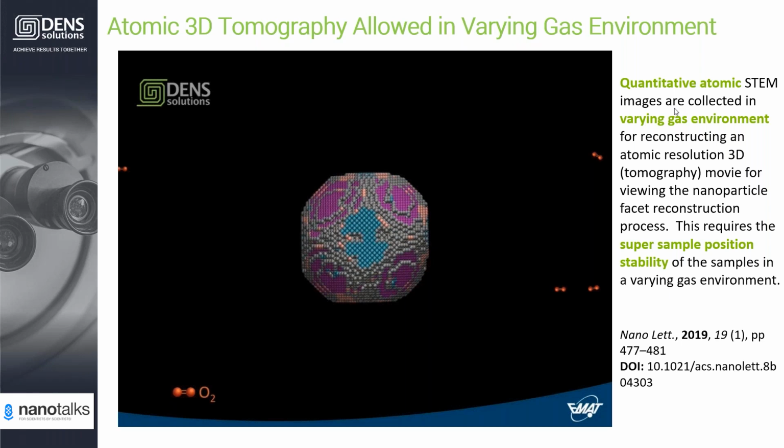Well, this is a common question, not only for in situ TEM but also for ex situ TEM, and a lot of our research briefly mentions it in the papers too. One way you can try is to increase and decrease your electron beam dose or dose rate to different levels and see if this changes your reactions.